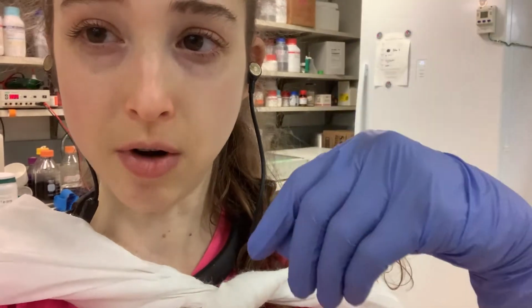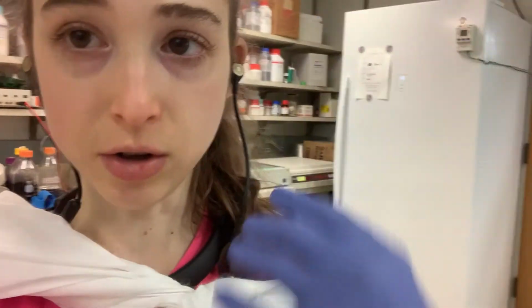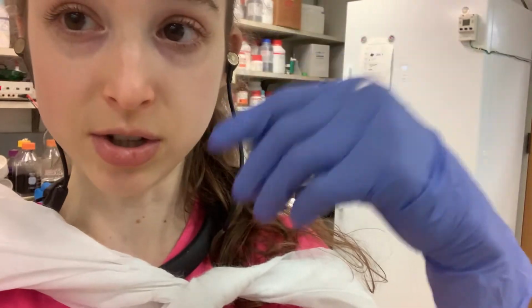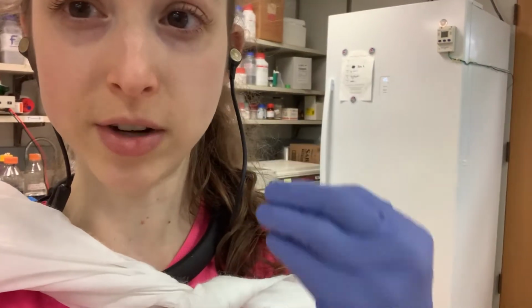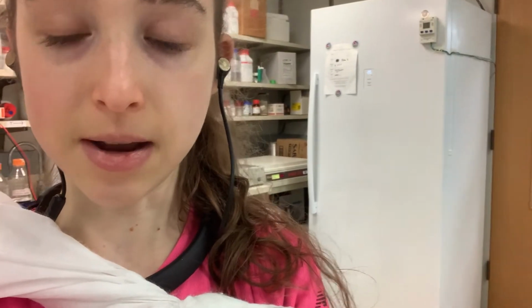What you'll notice is you can add NaOH, either pellets or a concentrated solution dropwise. Sometimes if it's way off, you're going to need to add a lot of base, and it's easier to add the pellets. But then as it gets closer, you can add dropwise with the concentrated solution, because that's easier for adding small amounts.